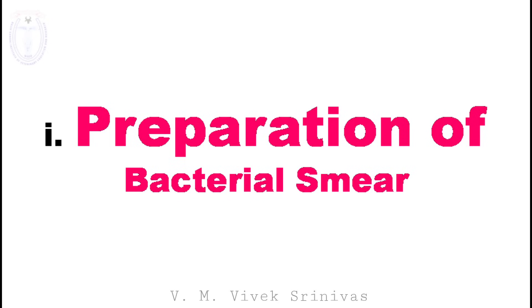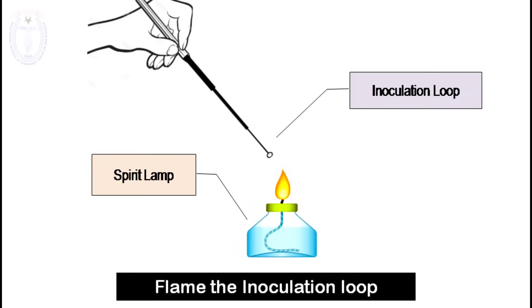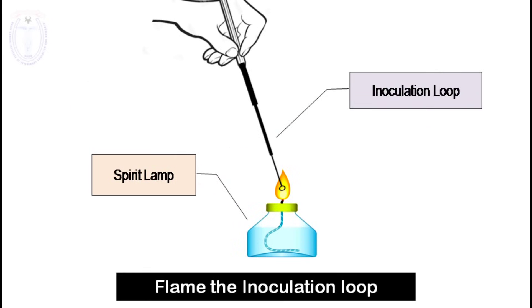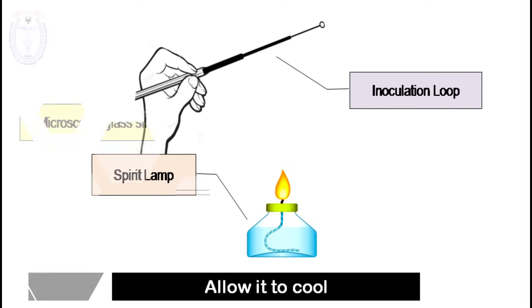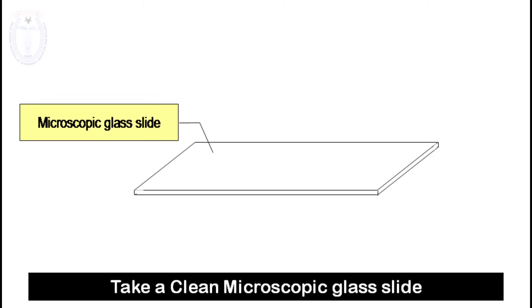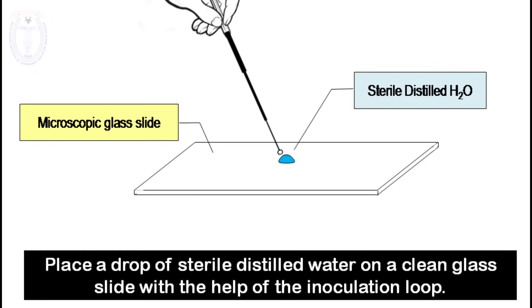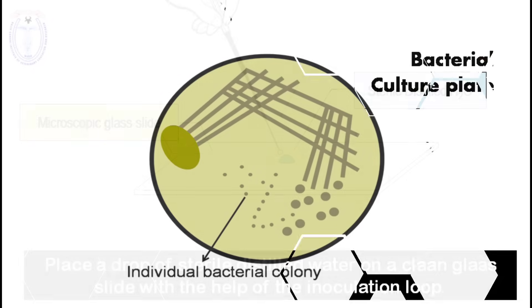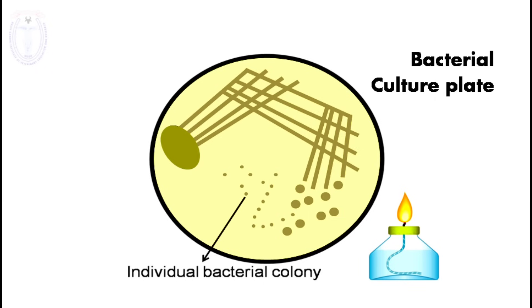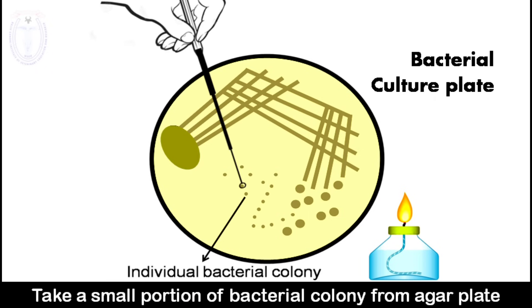First, flame the inoculation loop to red heat and allow it to cool. Take a clean microscopic glass slide and place a drop of sterile distilled water on it. With the help of the inoculation loop, take the bacterial culture plate, open it near the spirit lamp, and take a small portion of the bacterial colony.